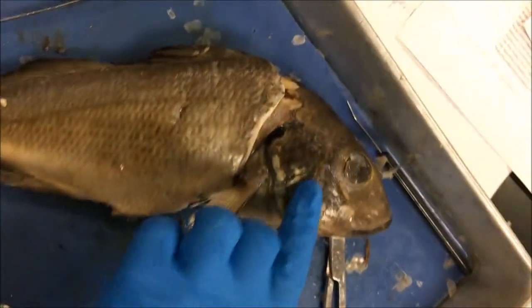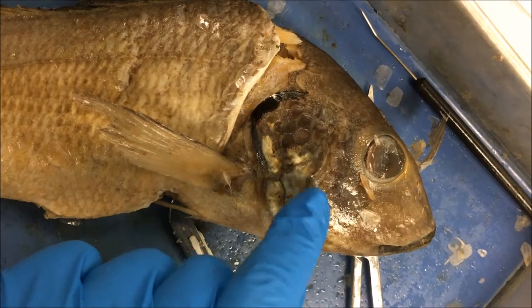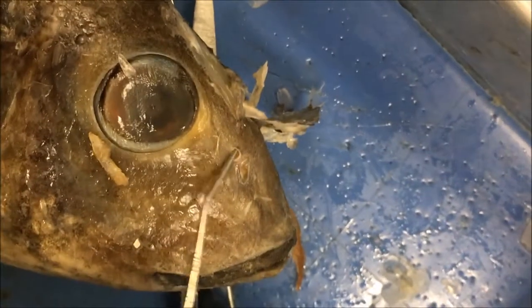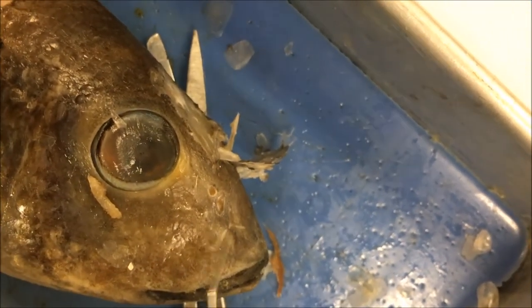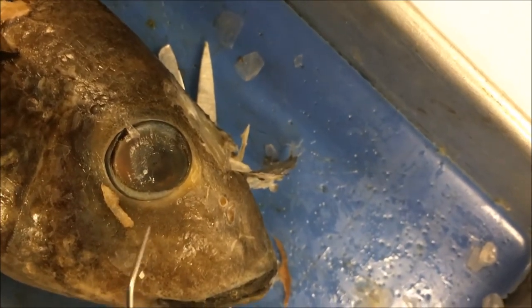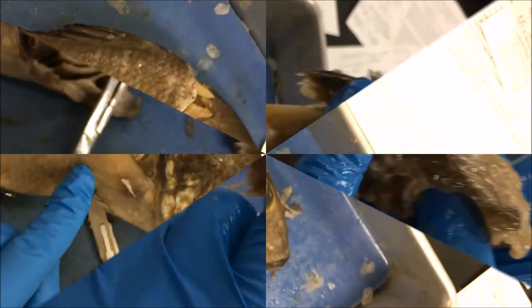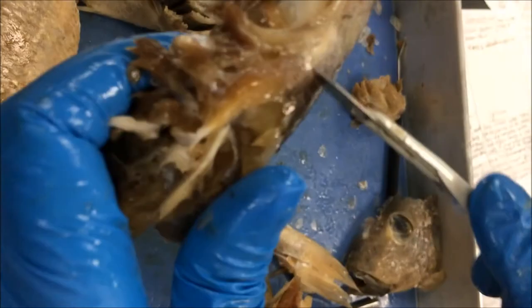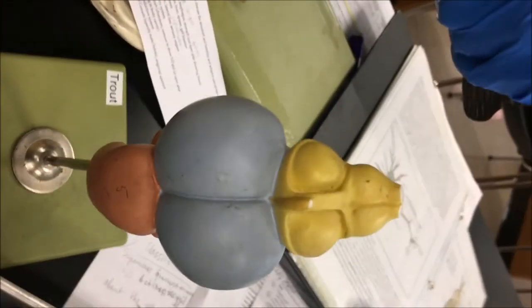Another sensory organ is the eye, which sends visual signals to the brain where they are processed. You can also see nostrils here — they can detect smell in the water. The nerves lead to the olfactory bulb in the brain where the signal is processed. The brain is located here, but we couldn't open the skull — it's too hard and the scalpel isn't sufficient. So we're going to use our model.